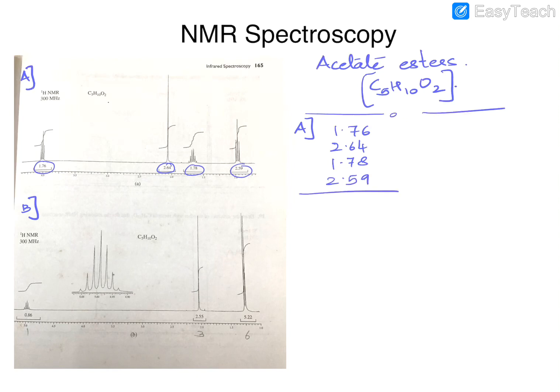When you total all of that, you get a value of 8.77, right? So this is the total weight of all the peaks that have appeared due to protons, and we've already been given in the structure that there are 10 protons. So if 8.77 corresponds to 10 protons, for one proton it should correspond to 0.87 approximately, right?